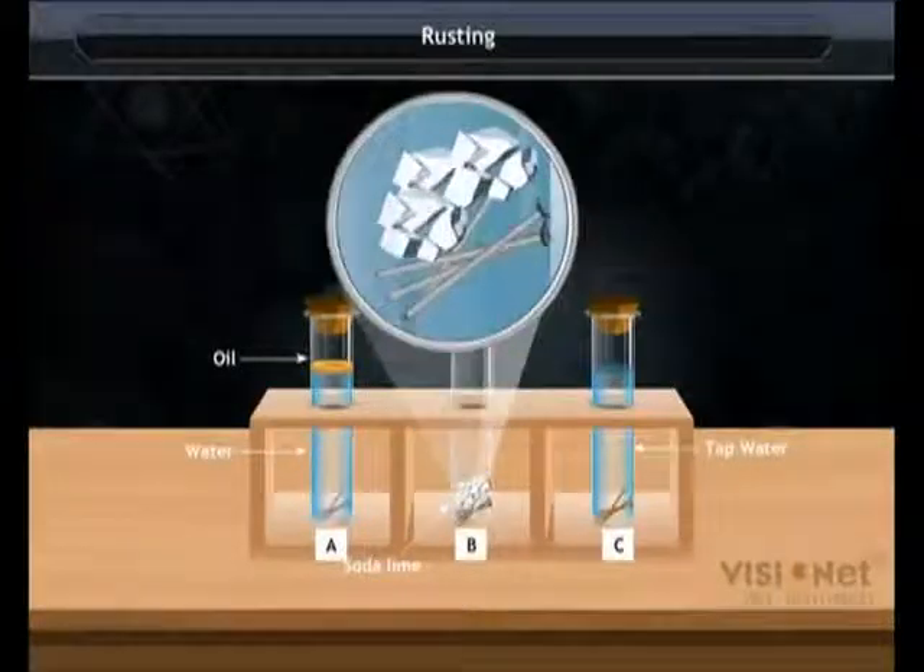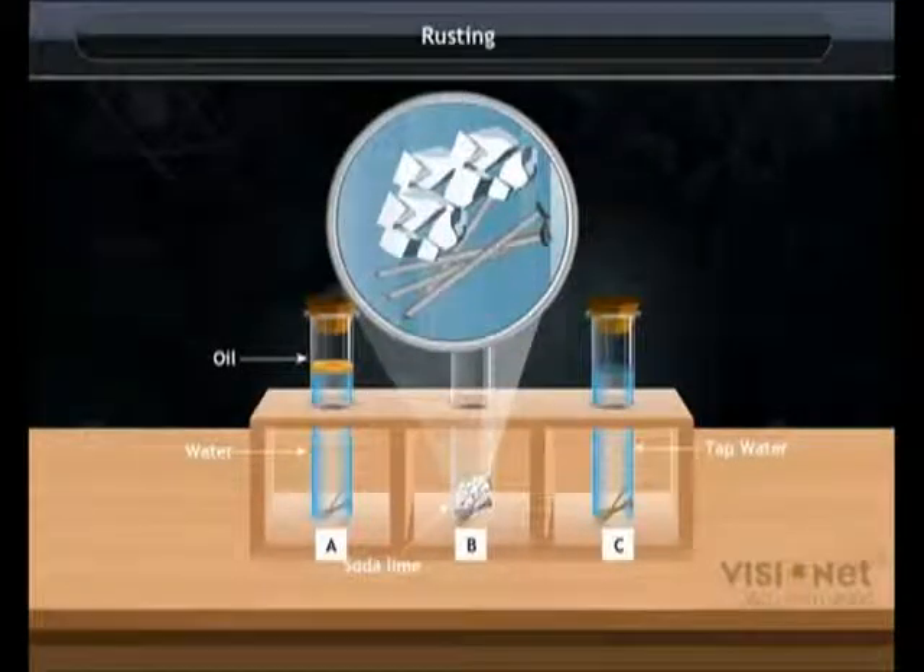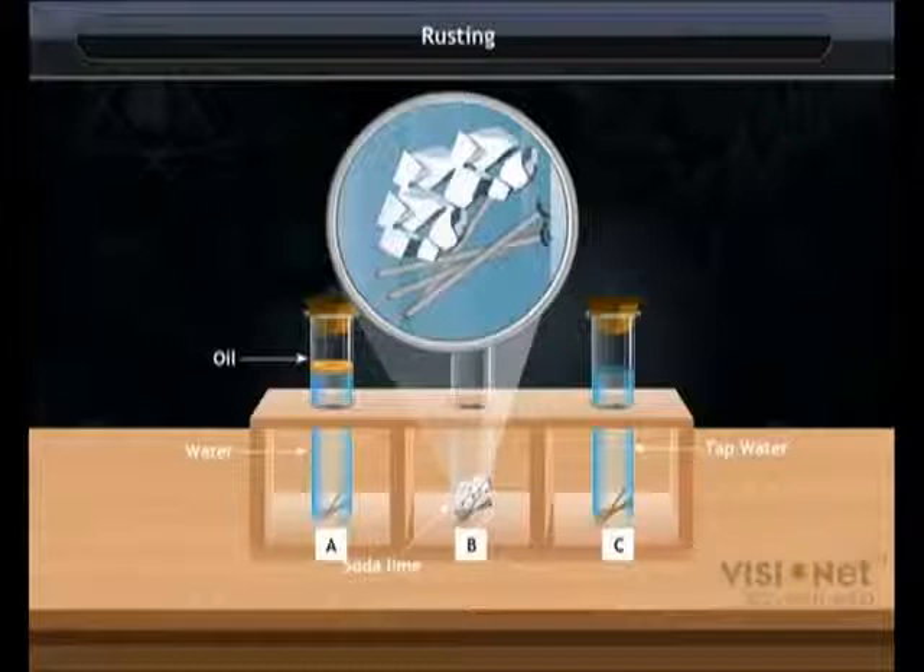In test tube B, the nails do not rust. They have air but no water and no carbon dioxide, as the soda lime absorbs all the carbon dioxide and water vapour.